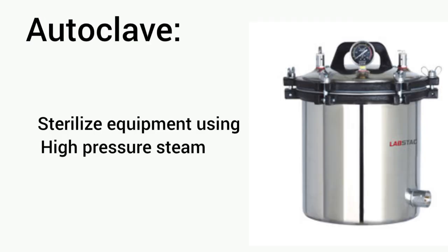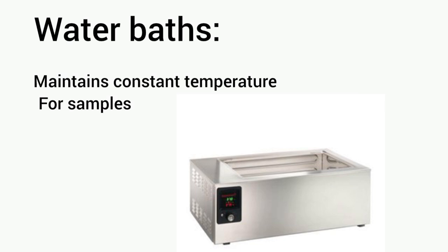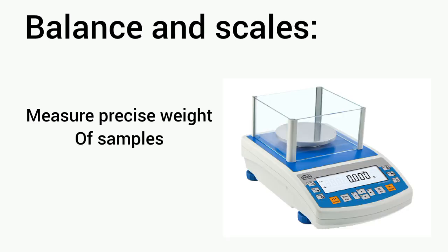Autoclave. It is used for sterilization of equipment, using high-pressure steam. Hot plates and stirrers. It is used for heating and mixing liquids. Laboratory water baths. It is used for maintaining constant temperature for samples. Laboratory balance and scale. It is used for measuring precise weight of samples.